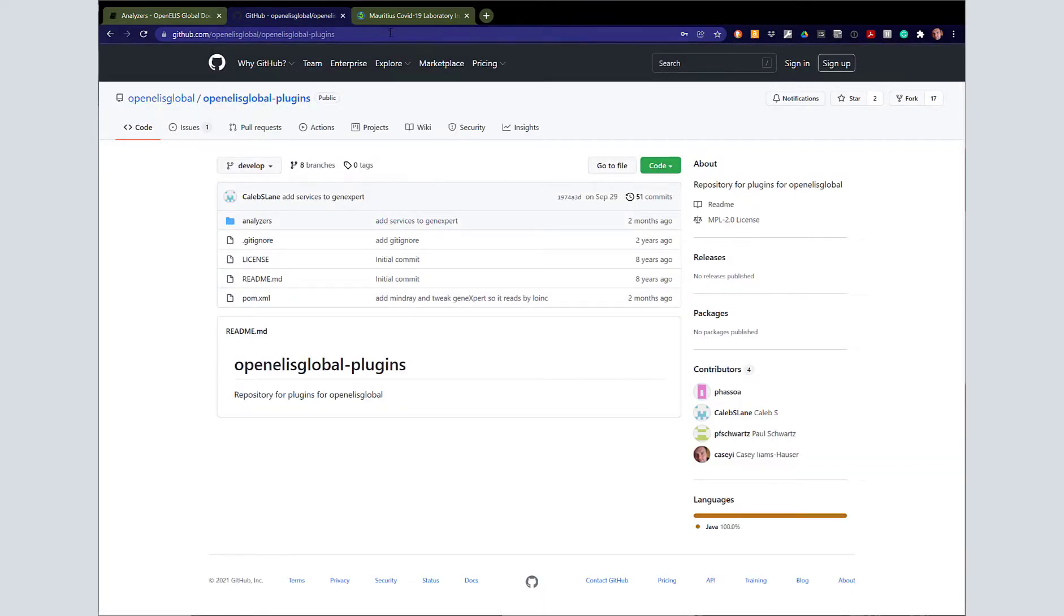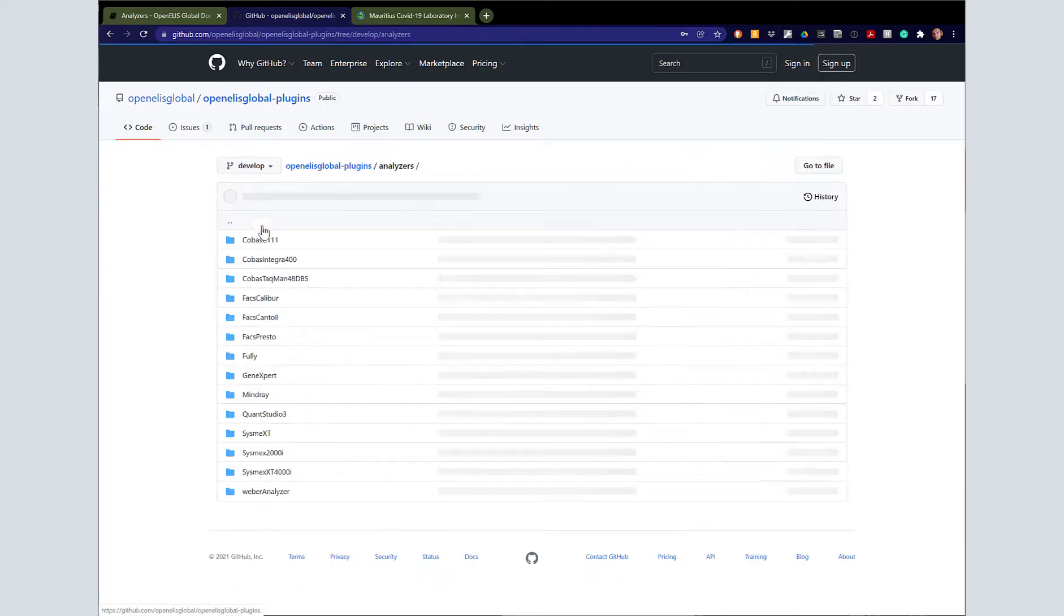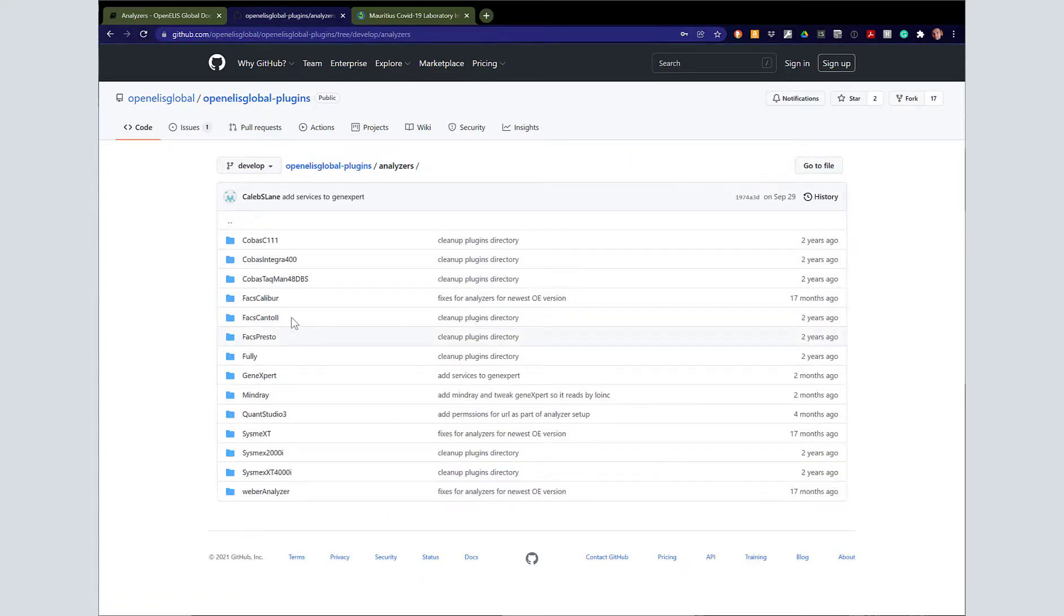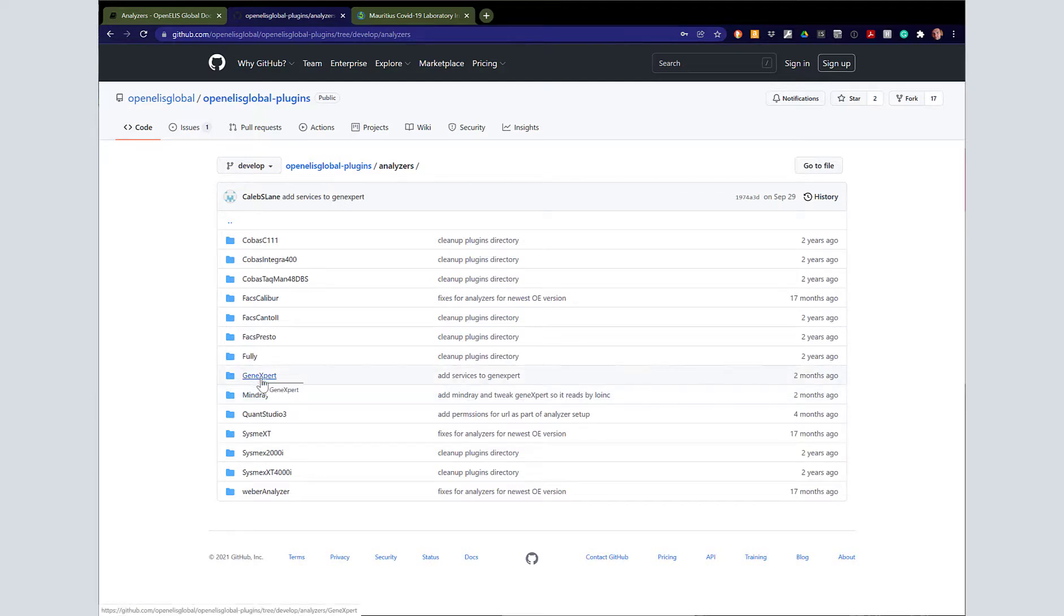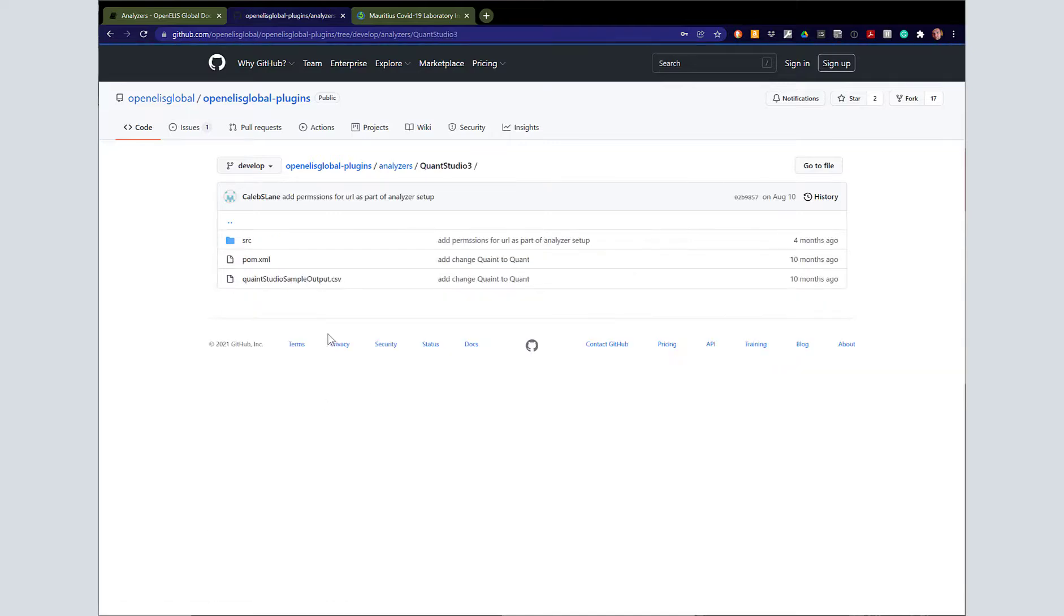If you want to know where to find the repository that contains the plugins, you can go to this repository: OpenAlice Global slash OpenAlice Global dash plugins. You might notice this is the root directory for the 1.0 version, but many of these are the 2.0 plugins. The GeneExpert, the MindRay, and the QuantStudio are all relatively new.